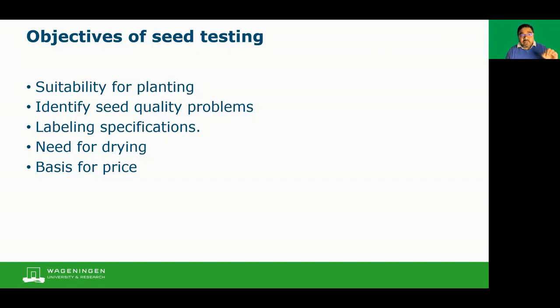Then one of the most important tests done during general seed testing is seed moisture. So do we need to dry? Because if we are packing wet seeds, then after a few months, all the seeds will be dead. So is there a need for drying? Those things will also be determined by seed testing.